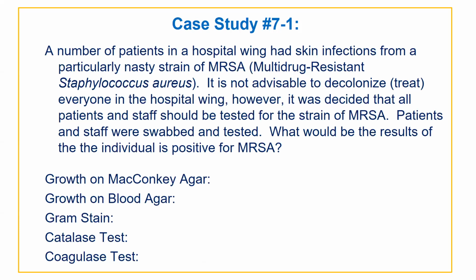I don't know if I have the words on here. I do. Okay, I wasn't sure. Sometimes I'm writing on the board, but I was trying to make sure everything was digital for people that are remote. So first thing, growth on MacConkey agar. And remember, does MacConkey agar grow gram positives or gram negatives? Yeah, it grows gram negatives.